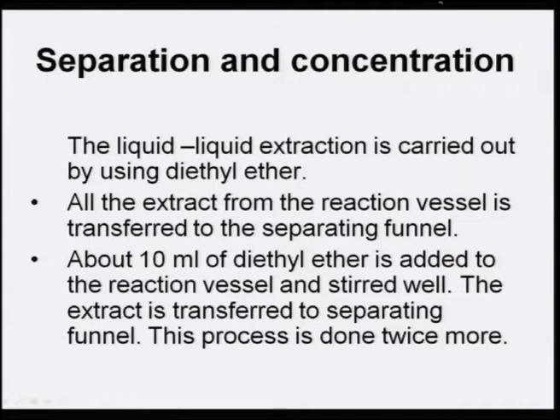Separation and concentration. The liquid-liquid extraction is carried out by using diethyl ether as a solvent. All the extract from the reaction vessel is transferred to the separating funnel. About 10 ml of the diethyl ether is added to the reaction vessel and stirred well. The extract is transferred to the separating funnel. This process is done twice more.